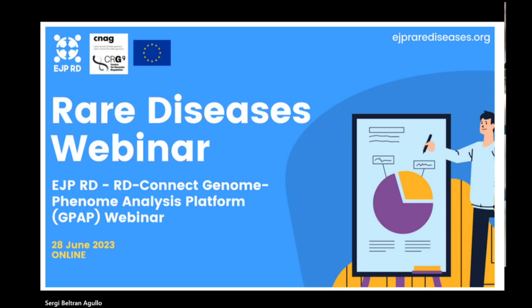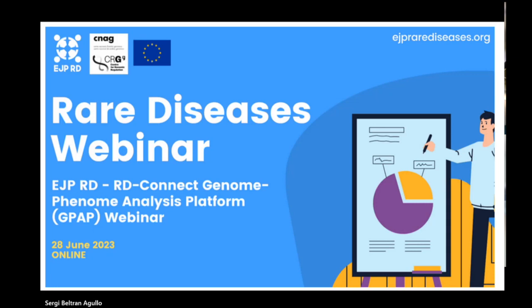I would like to welcome everyone. This is the webinar of the RD-Connect Genome-Phenome Analysis Platform. It's an introductory webinar to demonstrate the benefits of using the RD-Connect Genome-Phenome Analysis Platform for rare disease analysis, especially to show the new interface and the features of the analysis module of the GPAP.